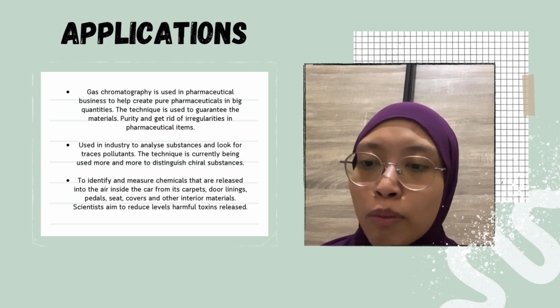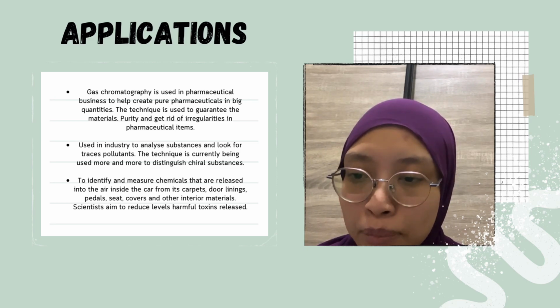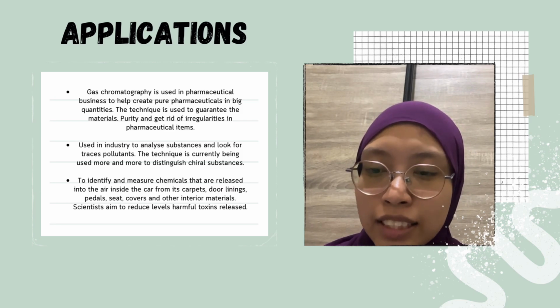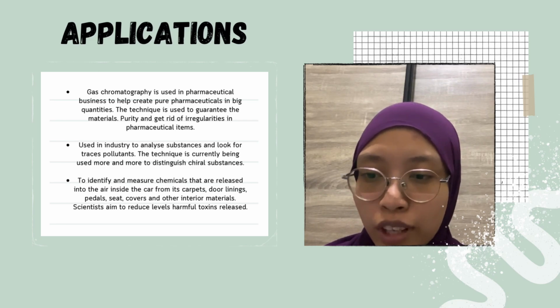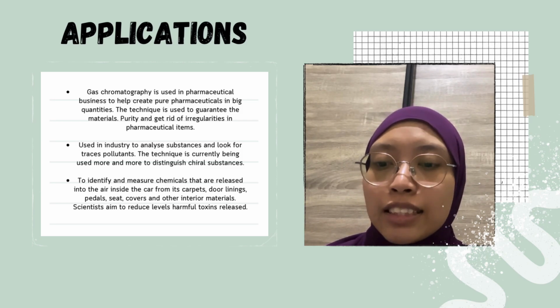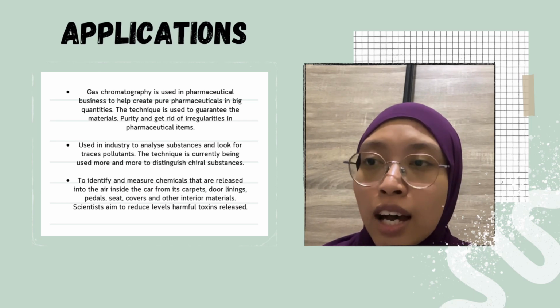Because with gas chromatography, fruit producers can accurately quantify the elements in their food, and the FDA ensures that it is of sufficient quality and safety. Thanks to gas chromatography, consumers can purchase food at the grocery store with confidence that it has been thoroughly tested for safety and that the food labels are accurate.